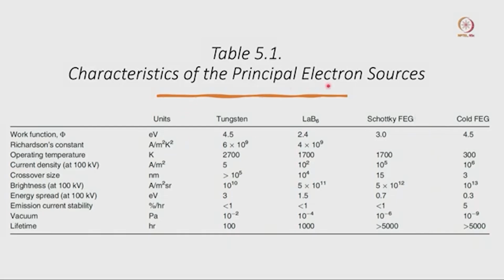For cryo it is very difficult to work with a tungsten filament or LaB6 filament, but for room temperature TEM we mostly use a heavy metal staining solution, either uranyl formate or uranyl acetate or some other heavy metal salt. As well, we can use a very strong electron dose.